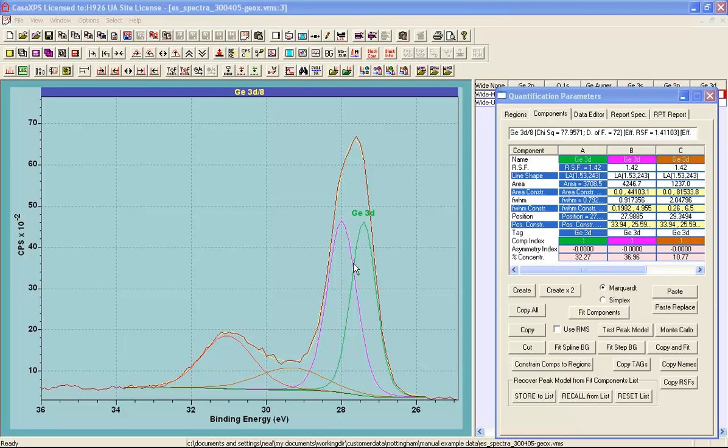6 are assigned a quantum number 5 halves, and the 5 halves indicates all 6 electrons have the same energy, normally speaking, and then there are 4 that are assigned the quantum number 3 halves, indicating there's a different energy for 4 electrons. So we ought to see a split in energy, and we ought to see a difference in the intensity of these two peaks in the ratio 6:4.